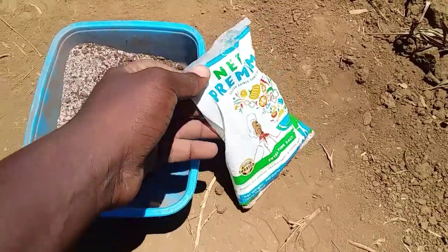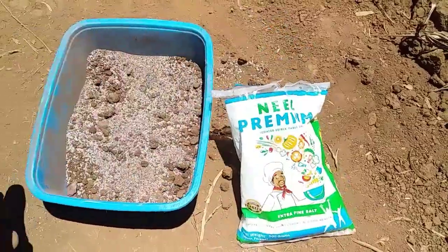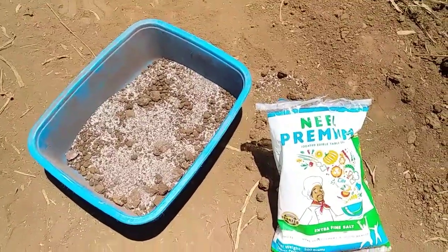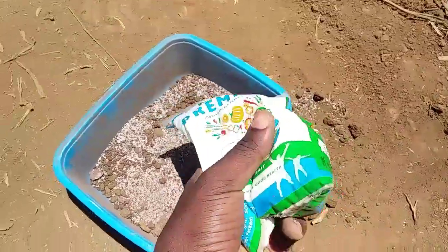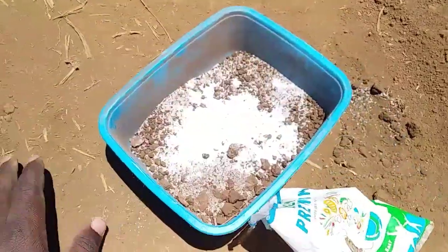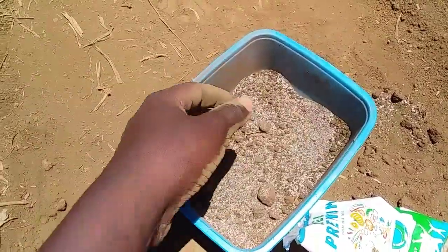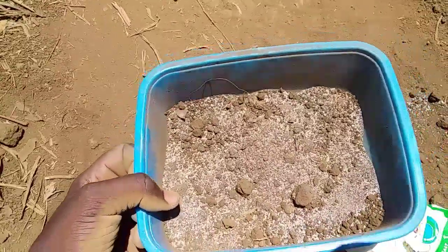Sometimes you may find that salt has mixed with sand by accident and you have no way to separate them. What you see here is a mixture of salt and sand. I'm going to add more salt and more sand into this container, and in this video I'm going to show you how you can separate these two mixtures.